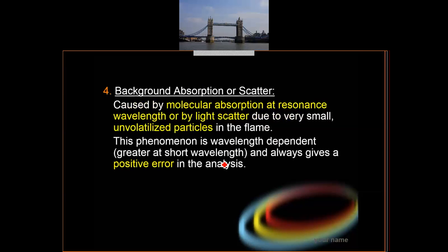Okay. Then, not just those three, we also have background scatter. This is also one of the problems. We did not extract the sample well, and then we have a lot of different elements with it that cannot be measured and will interfere with the results. The sample should have a low amount of sodium, for example, but because of this background scatter, we see a lot of sodium, but actually there's not much sodium inside the sample.